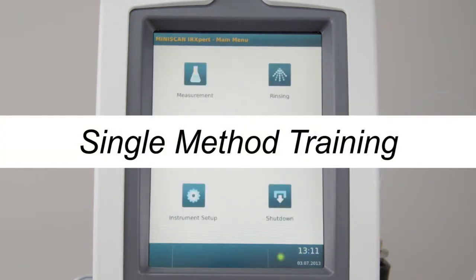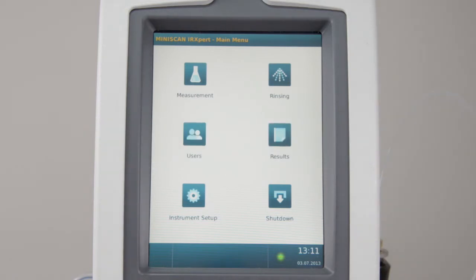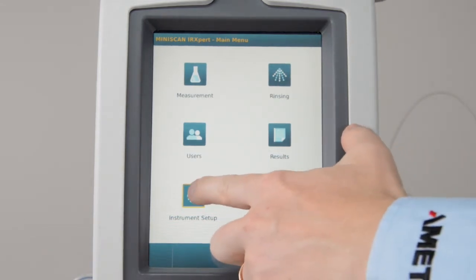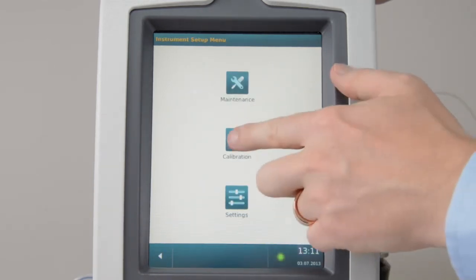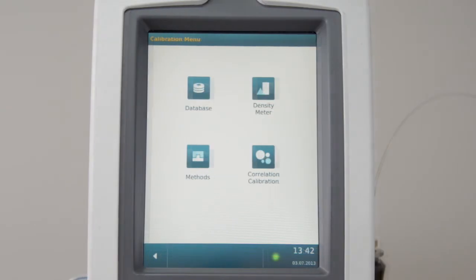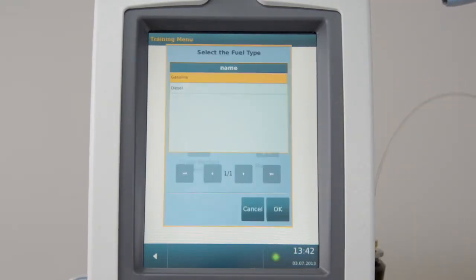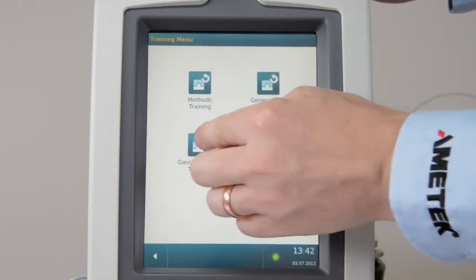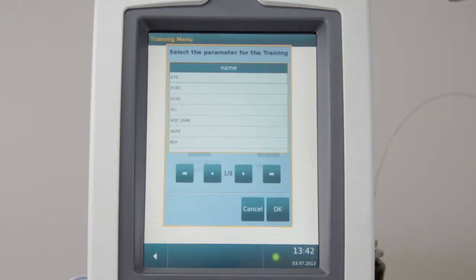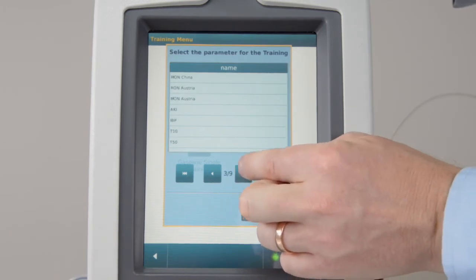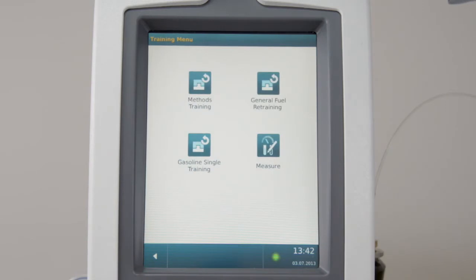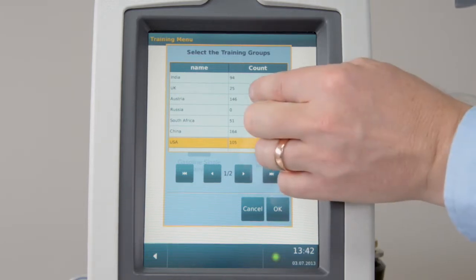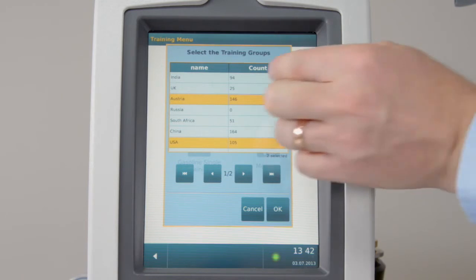Single Method Training. If you have calibrated a new fuel group into the instrument, start the Single Training to add the new fuel group to a prediction method. Go to Setup. Enter Calibration. Go to Correlation Calibration. Enter the fuel type. Select Single Training. Select the method to be trained. The groups used for this method are highlighted. Add your group and press OK.